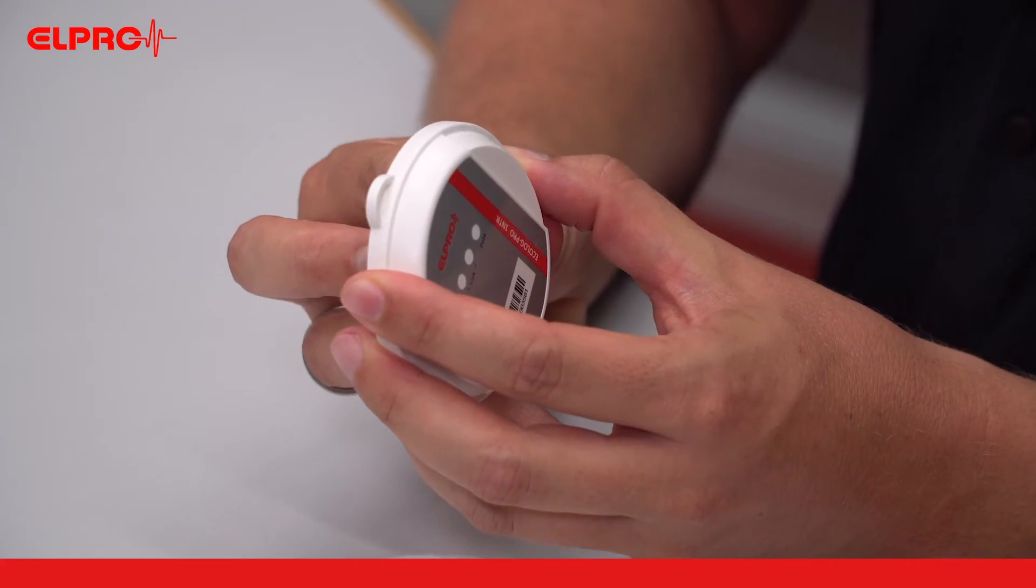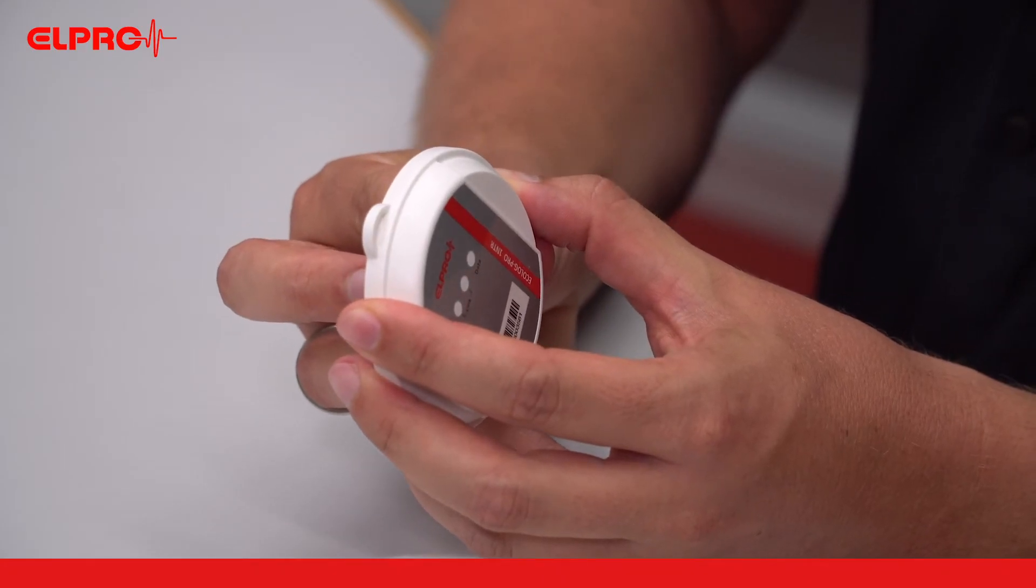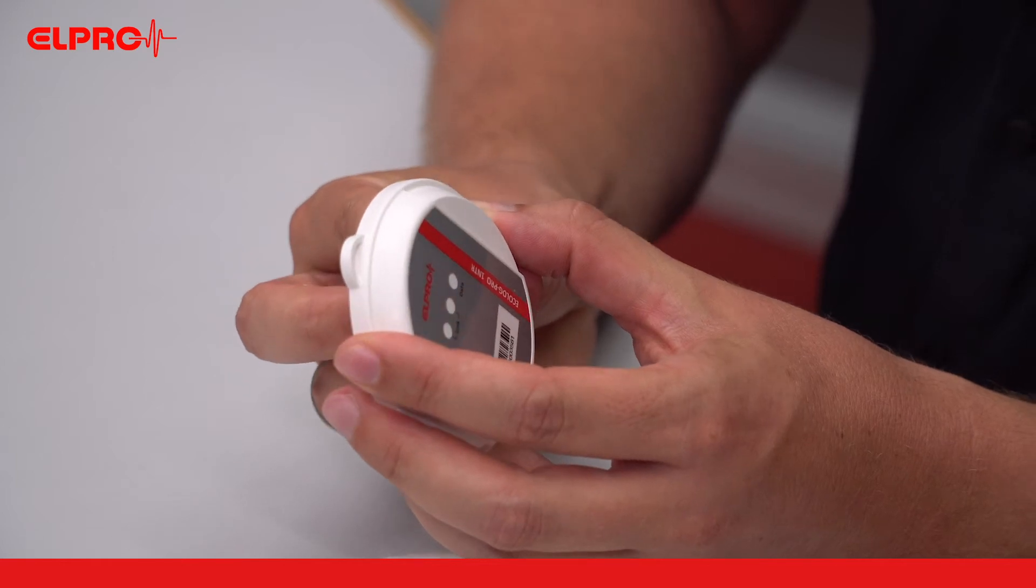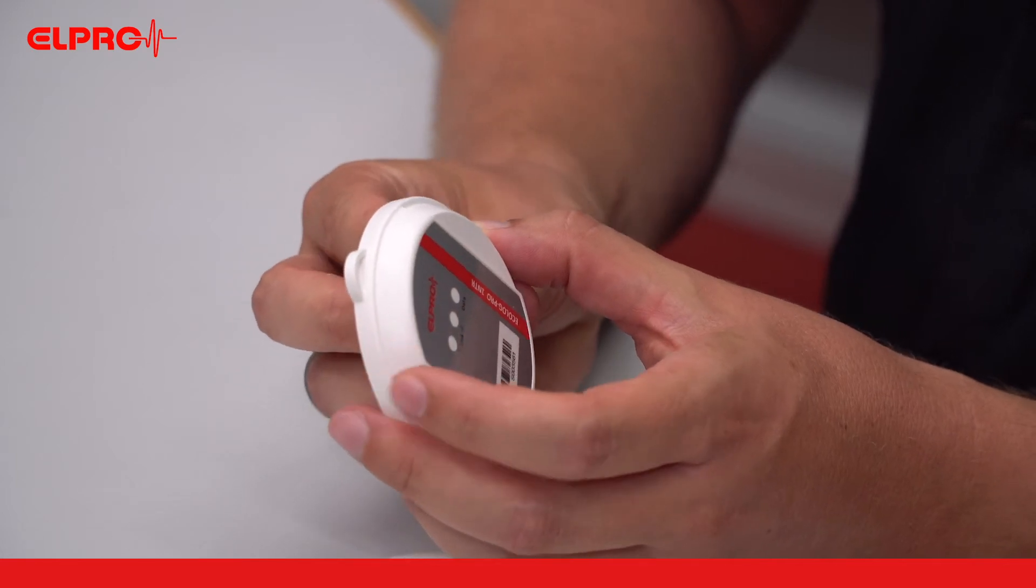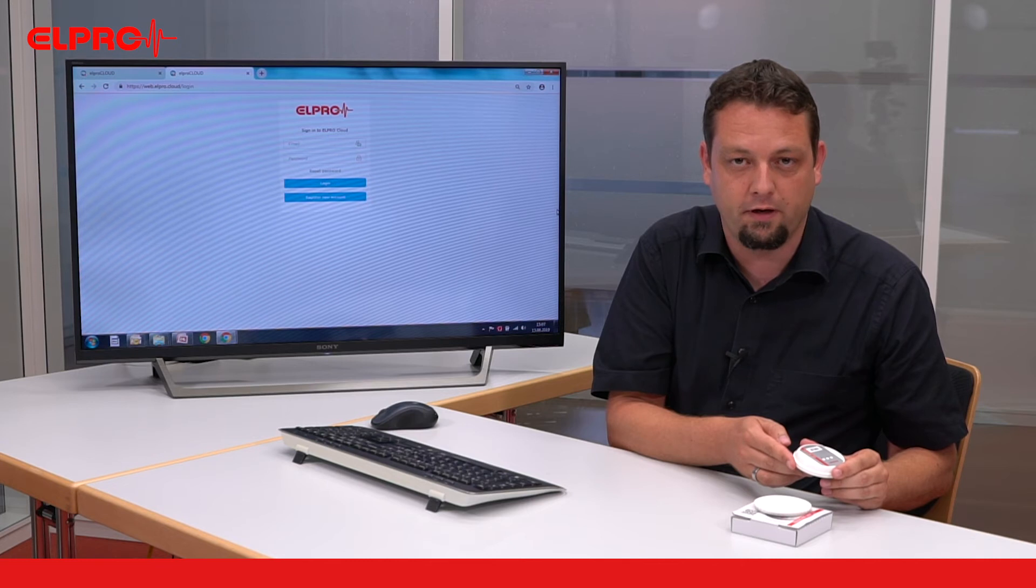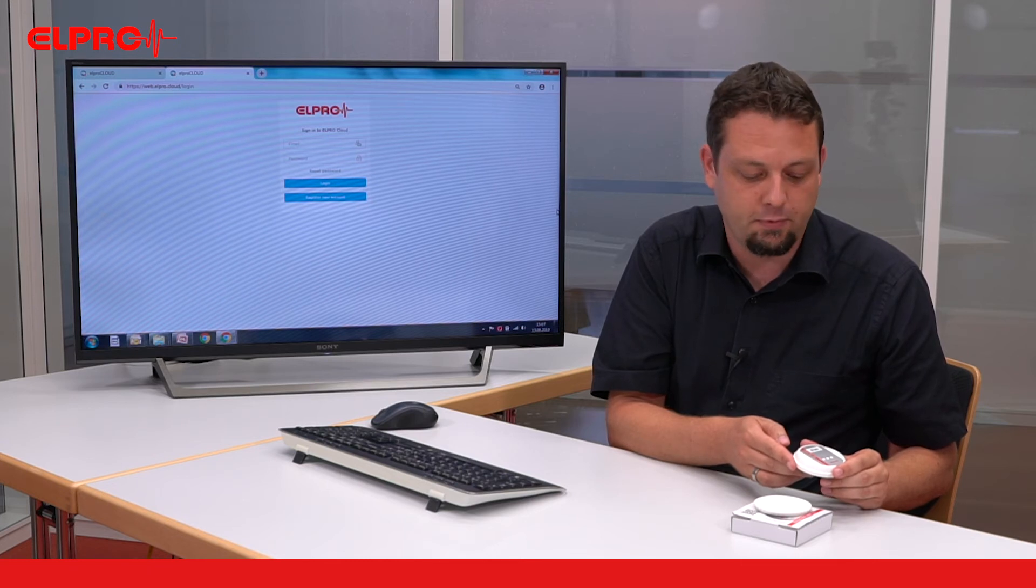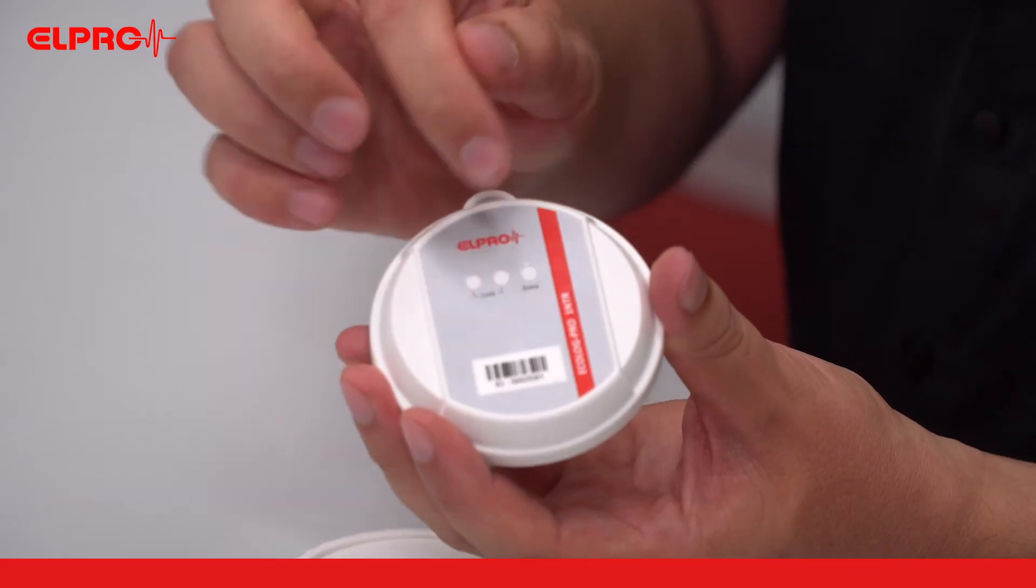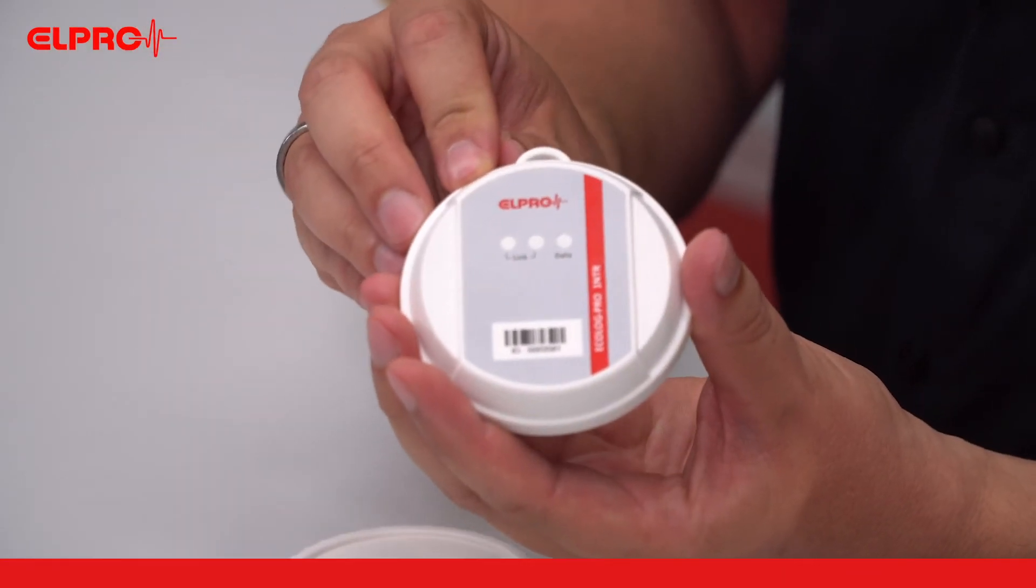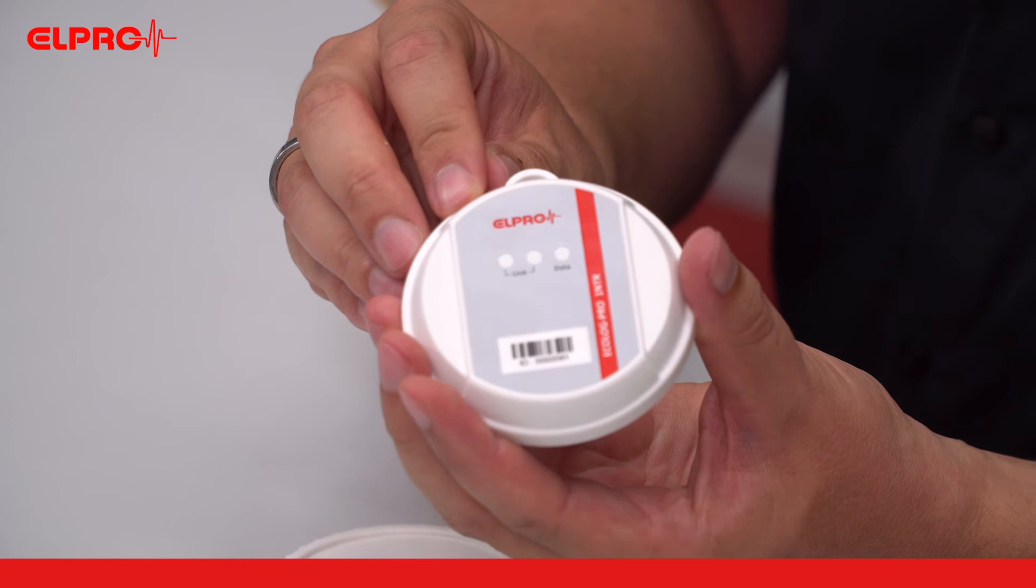As you can see it immediately starts blinking in red and as soon as the connection to the communication module Ecoloc Pro RBR was established it will switch to the second LED blinking in green.